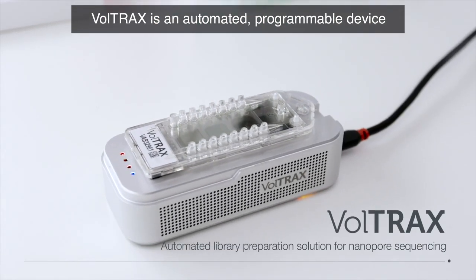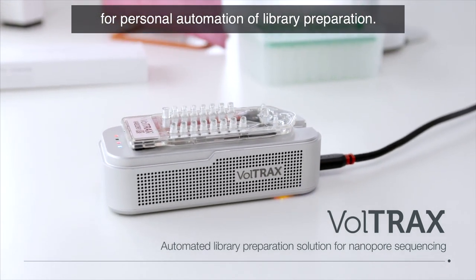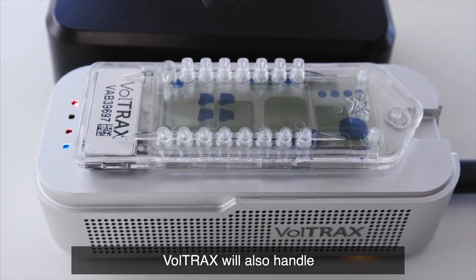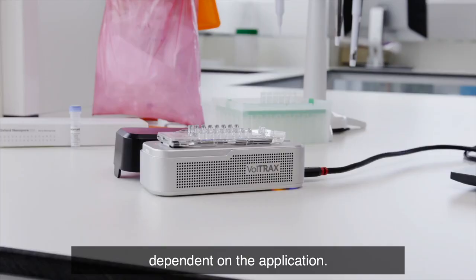Voltrax is an automated programmable device developed by Oxford Nanopore for personal automation of library preparation. As well as adding the adapters and motor protein, Voltrax will also handle any upstream preparation processes which may be necessary dependent on the application.